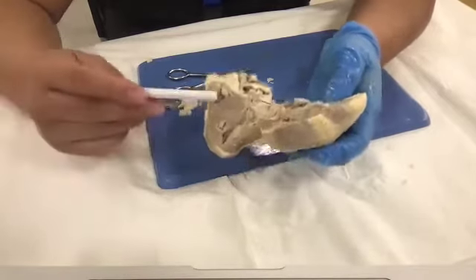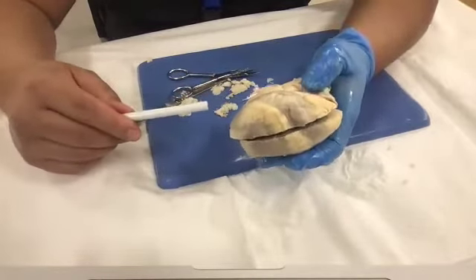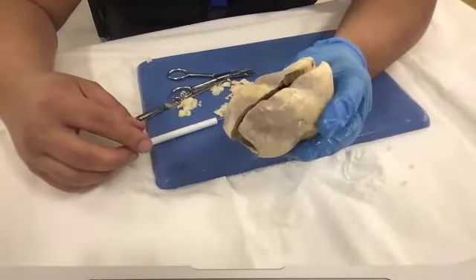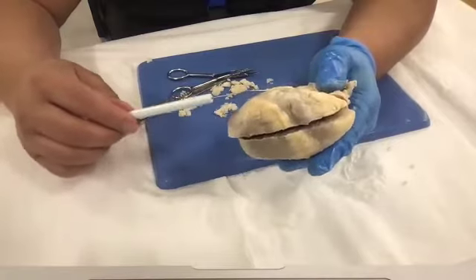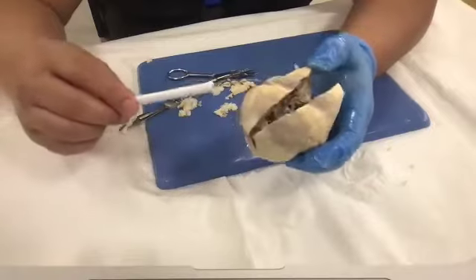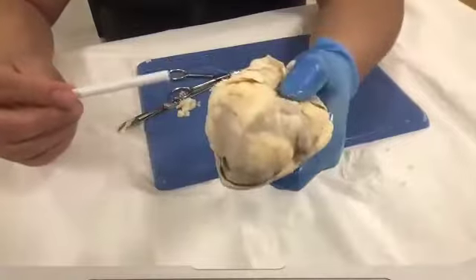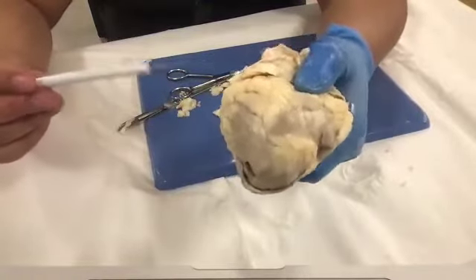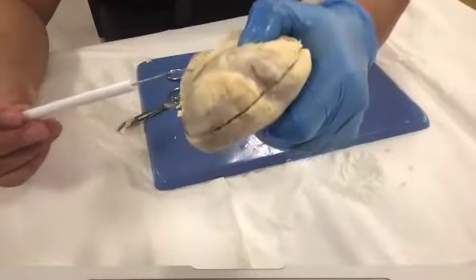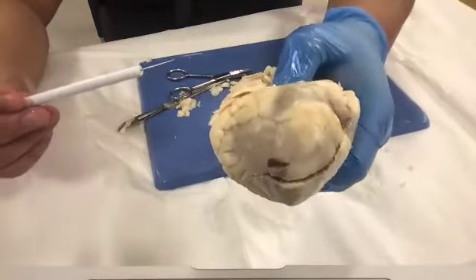So with that being said, those are your internal structures, and basically your external structures. And that's pretty much the heart and what's more important about the heart. And we took way more time dissecting this, removing all the fat and really looking into it. But those of you viewers at home, I just wanted you guys to get an overview so that you, at least, can be a video participant on the cardiac lab.